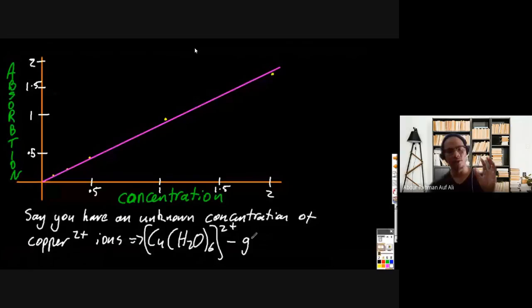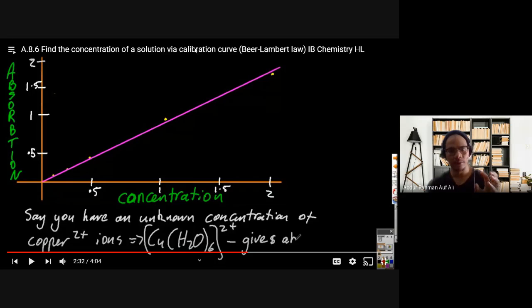Whether our spectrophotometer is functioning well ataupun tidak, because that's one of the things also. Our instrument tu sama lah macam kereta, kalau kita tak servis dia, kita tak jaga dia, dia akan rosak. So our instrument dekat dalam makmal, we also need to calibrate, kita kena servis dia. So this is one method untuk servis instrument, untuk calibrate instrument tu, untuk check whether it is functioning dengan betul ataupun tidak.